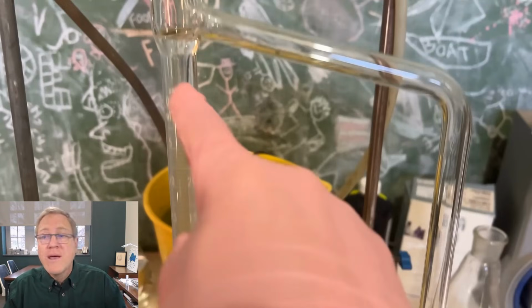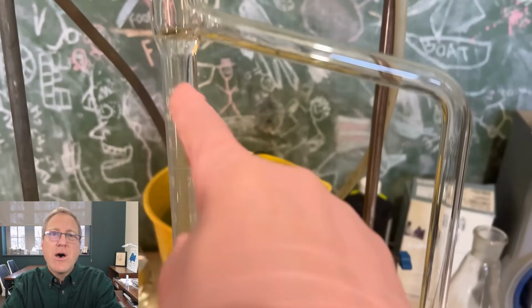See how clear that toluene is at the top of the trap side of this distillation apparatus? That's a good sign. Once everything is clear, that shows that there's really almost no water being formed. And if there's no water being formed, then the reaction's probably done its thing. And he says he let this go about 12 hours. So everything ought to be done. Visually, it looks like it's done. This is just visual confirmation of what he suspects already.